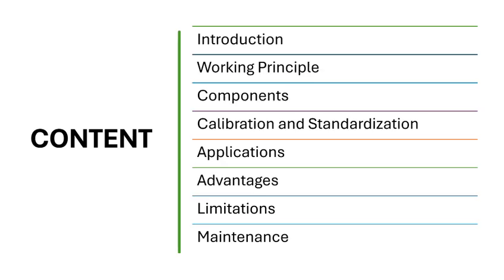Here is an overview of the presentation. We will start with an introduction to the flame photometer, move on to its principle of operations, the components, calibration, application, advantages, limitations, and finally the maintenance tips.